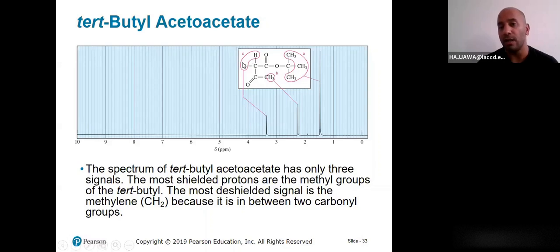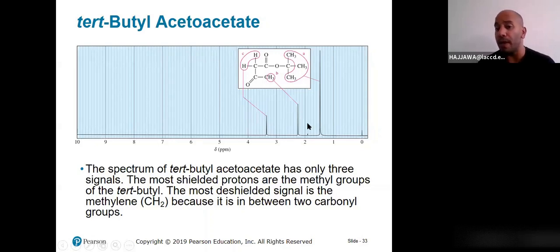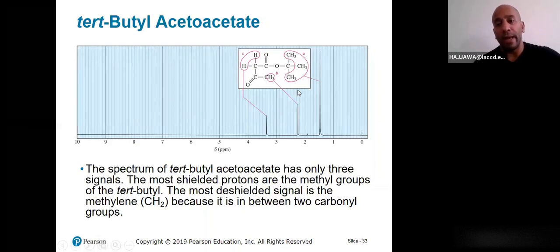You could see that these hydrogens that are labeled C, they are surrounded by 2 deshielding effects, 2 carbonyls, more than the hydrogens that are sitting on the methyl. So the methyl, as you probably expected, is going to read around 2 ppm, while this CH2 is going to read around 3.5 ppm. So there should be a difference between the 2 types of hydrogen, the C type and the B type. While A is just another tert-butyl, and this time we're going to see it around 1 ppm.